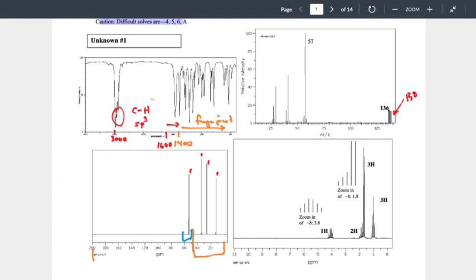Right? There are a variety of ways to go through and do that, right? And we'll look at a couple here. First and foremost, what you could do is look for your integration information, which is further on within our chart, okay? But we'll come back to that. That integration information can be written as written here, 1H, 2H, 3H, 3H. There were 4 of these H things floating around. Why? 4 signals, right? But your integration doesn't have to be given to you in that format.